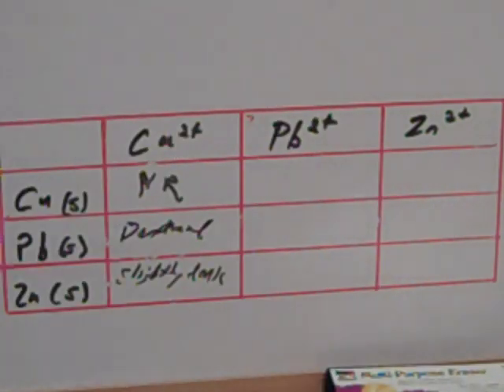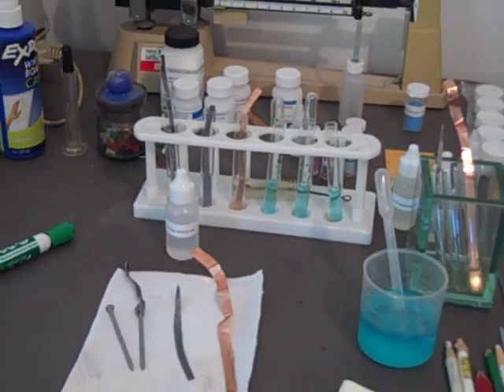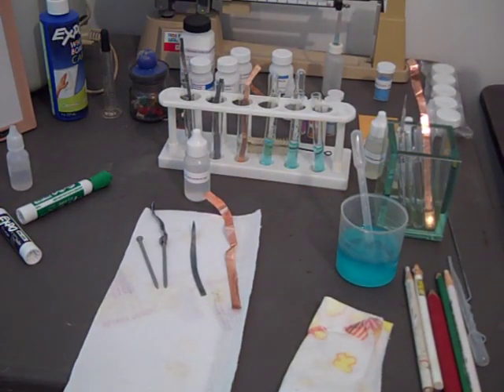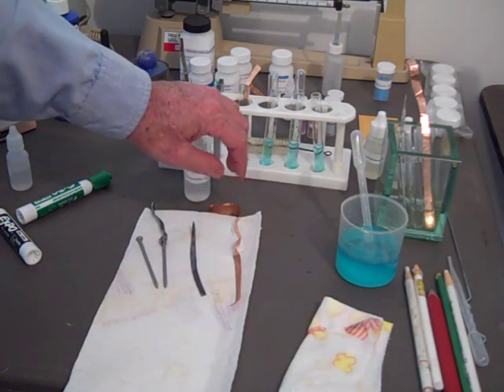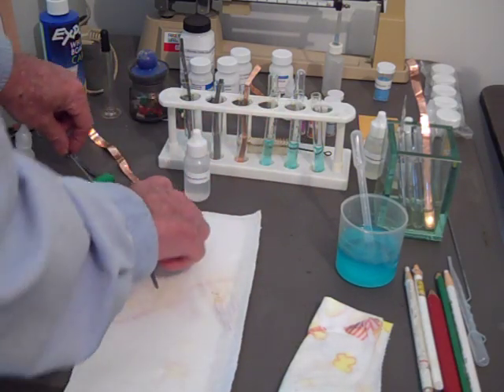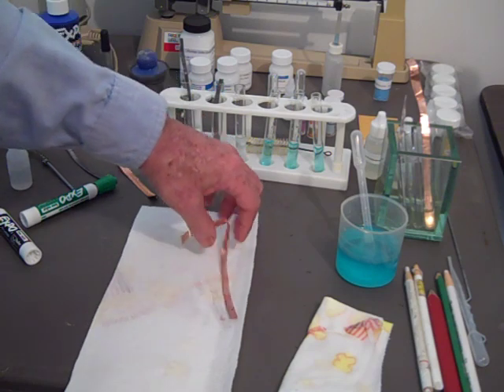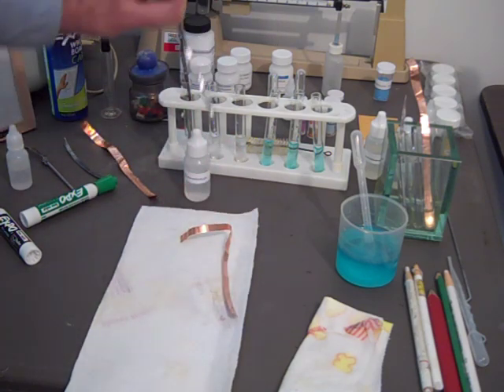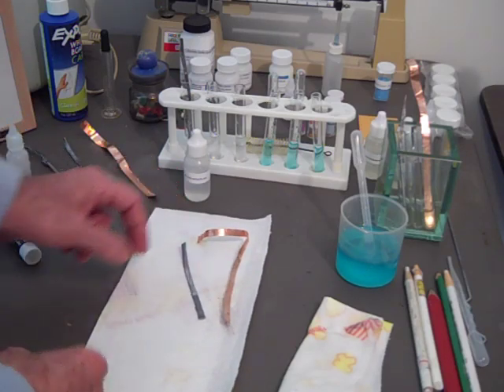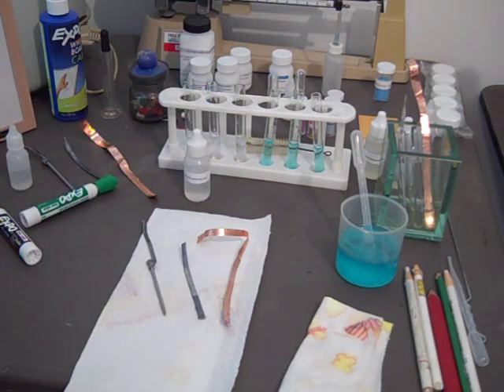Let's take a look now at the lead nitrate samples. See what they look like. Put these away. Pull out the copper from the lead nitrate. Again, nothing really. We didn't expect that. And again, we shouldn't have had anything here, lead nitrate, because that's lead. It shouldn't have reacted. But the zinc should have, and it's very slight. So we have an oddity.